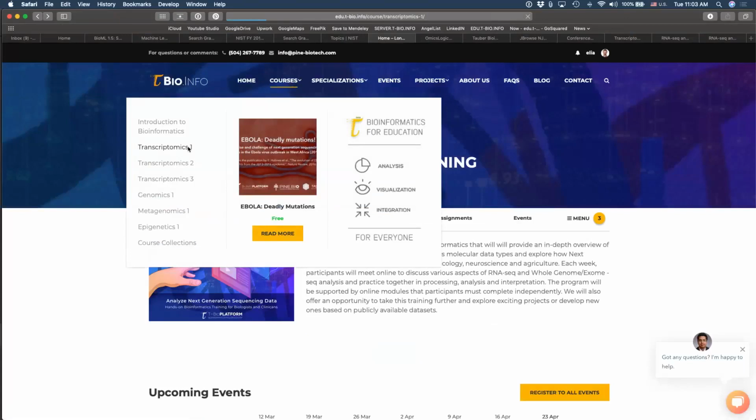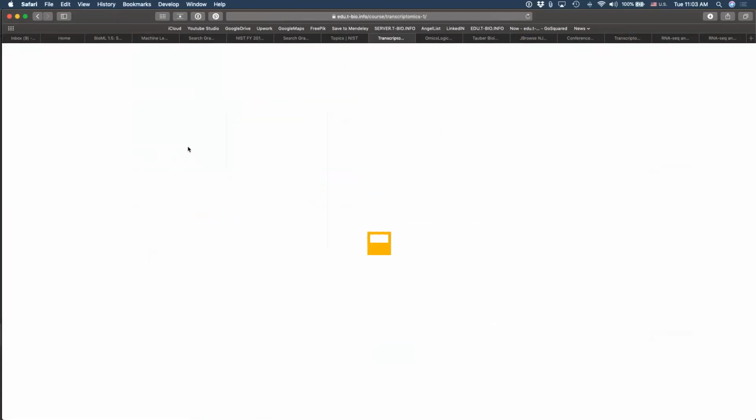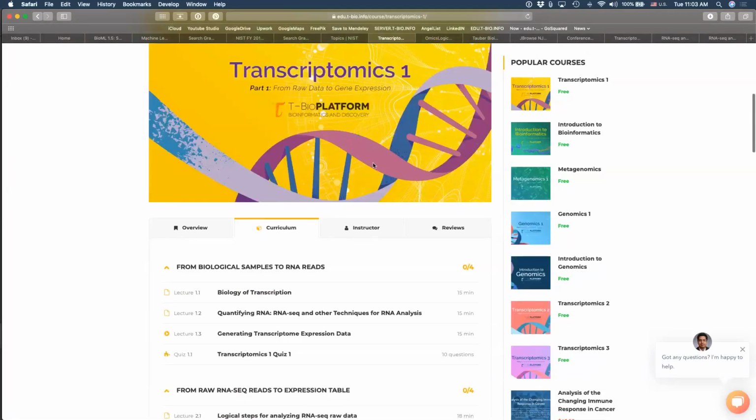Transcriptomics 1 will give you files and a step-by-step tutorial on how to go through the steps that we just did today. So if you complete this session by our next time, you will have enough practice and enough experience working with raw FASTQ files. In the next time that we will talk, we will touch on Transcriptomics 2. And Transcriptomics 2 will talk about different quantification techniques, including differential gene expression and various adaptations of the regression model to study variation in RNA-seq data, in gene expression data.